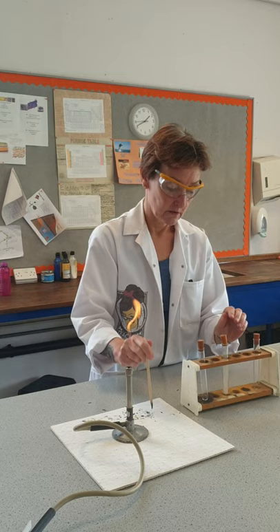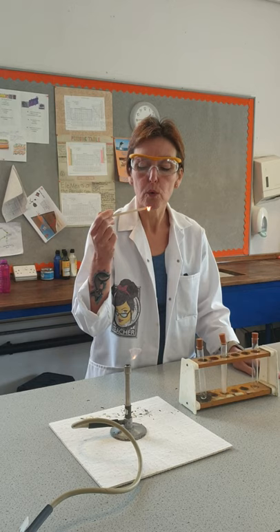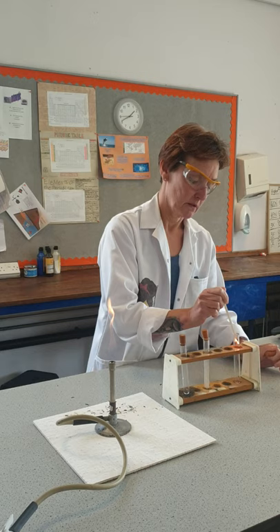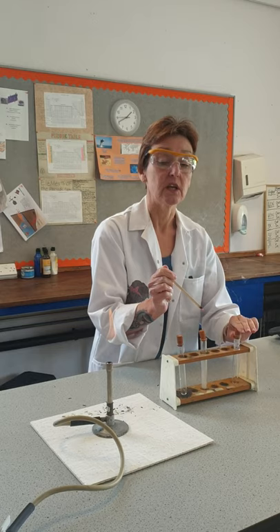With the oxygen I'm going to light the splint, then blow it out so it's just glowing. Take the top off the oxygen carefully, pop my glowing splint in, and you can see it lights up again — and that's the test for oxygen. It relights a glowing splint.